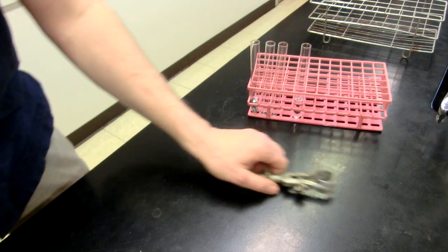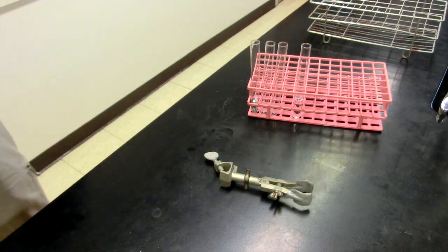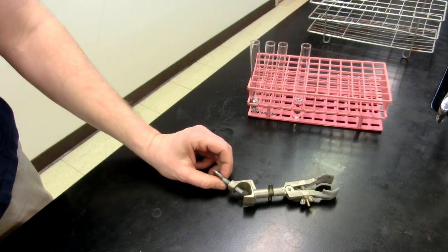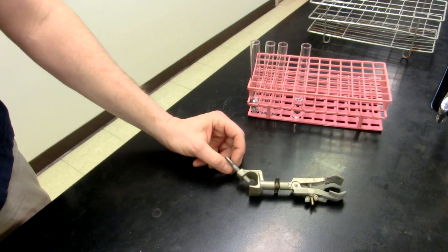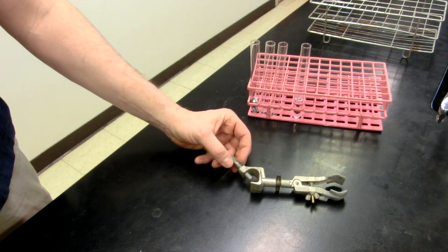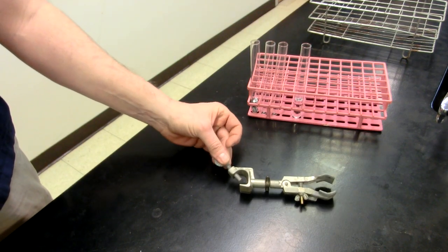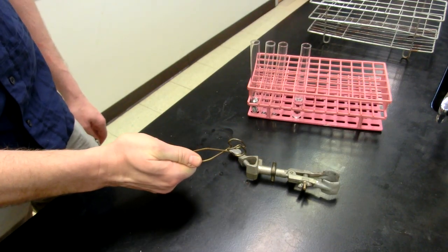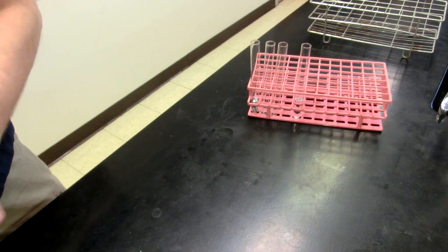This one over here is a test tube clamp. Test tube clamp is designed to clamp into position or stay in position on a ring stand. A later video will be used to describe how to use this properly. For right now, we're going to be spending more time talking about the test tube holder instead.